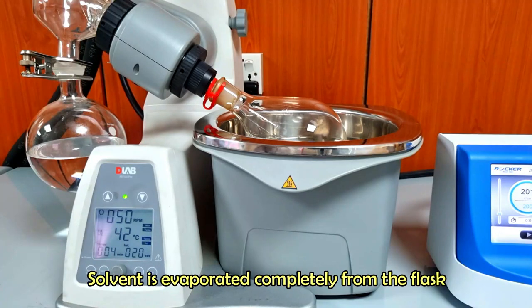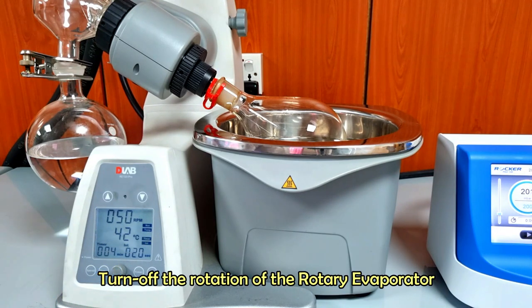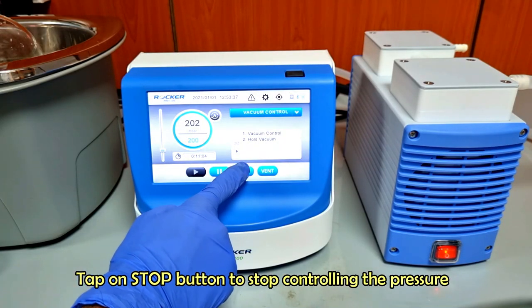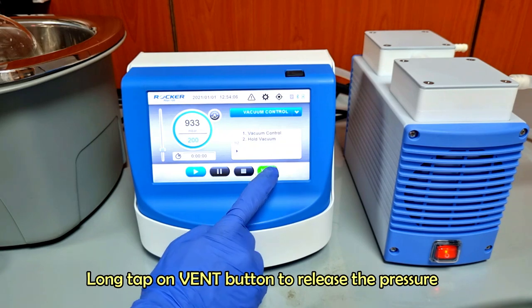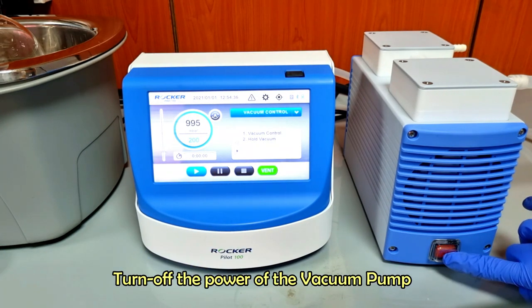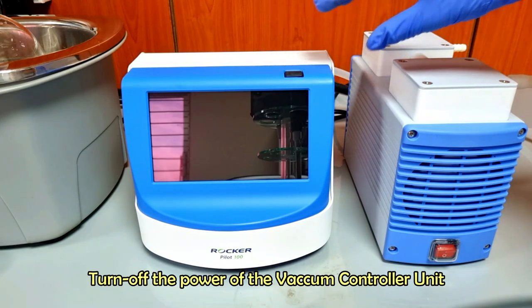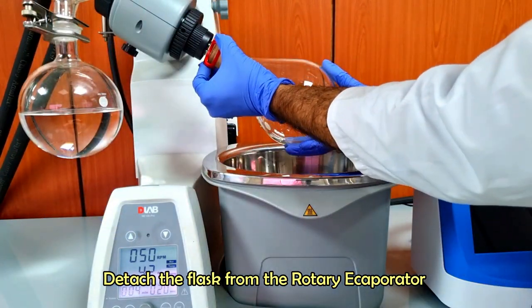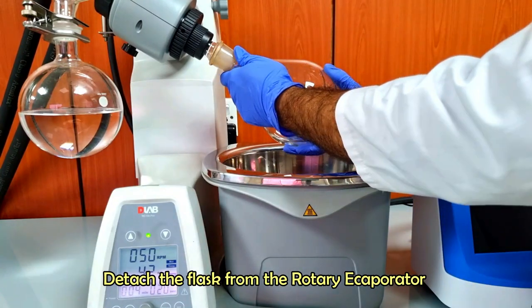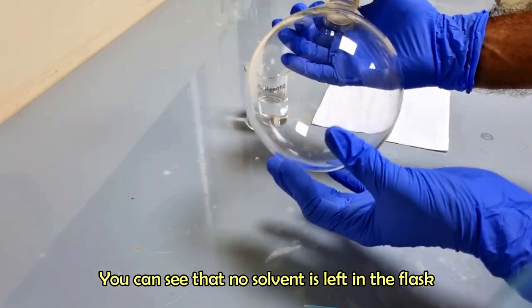Solvent is evaporated completely from the flask. Tap on the stop button to stop controlling the pressure and long tap on the vent button to release the pressure. Turn off the rotary evaporator setup. Detach the flask from the rotary evaporator. You can see that no solvent is left in the flask.